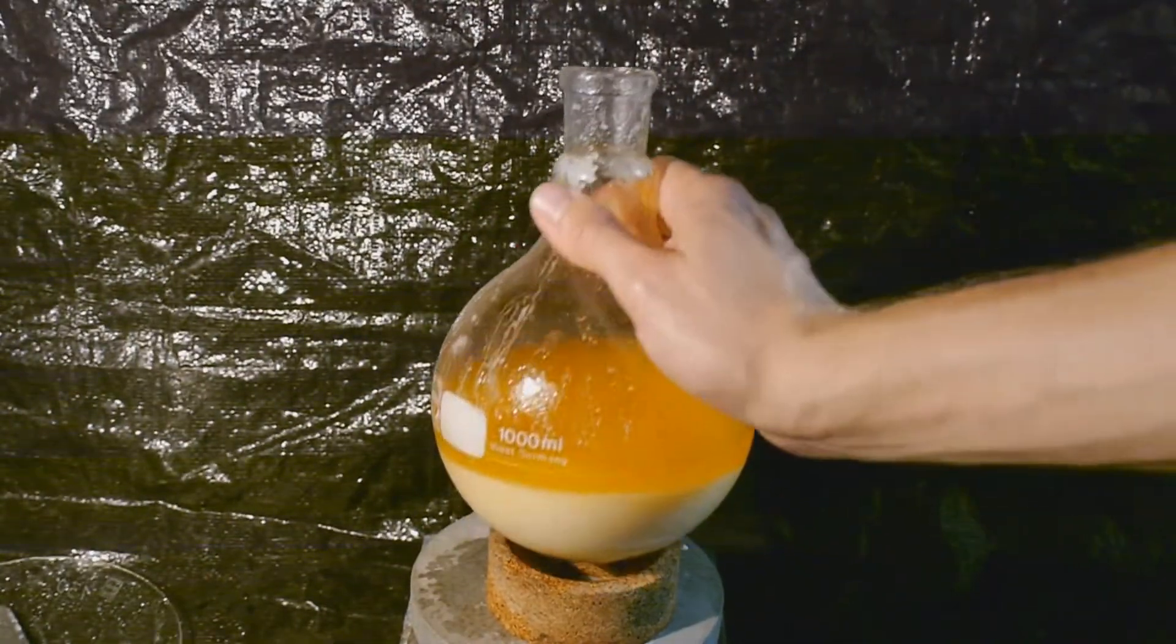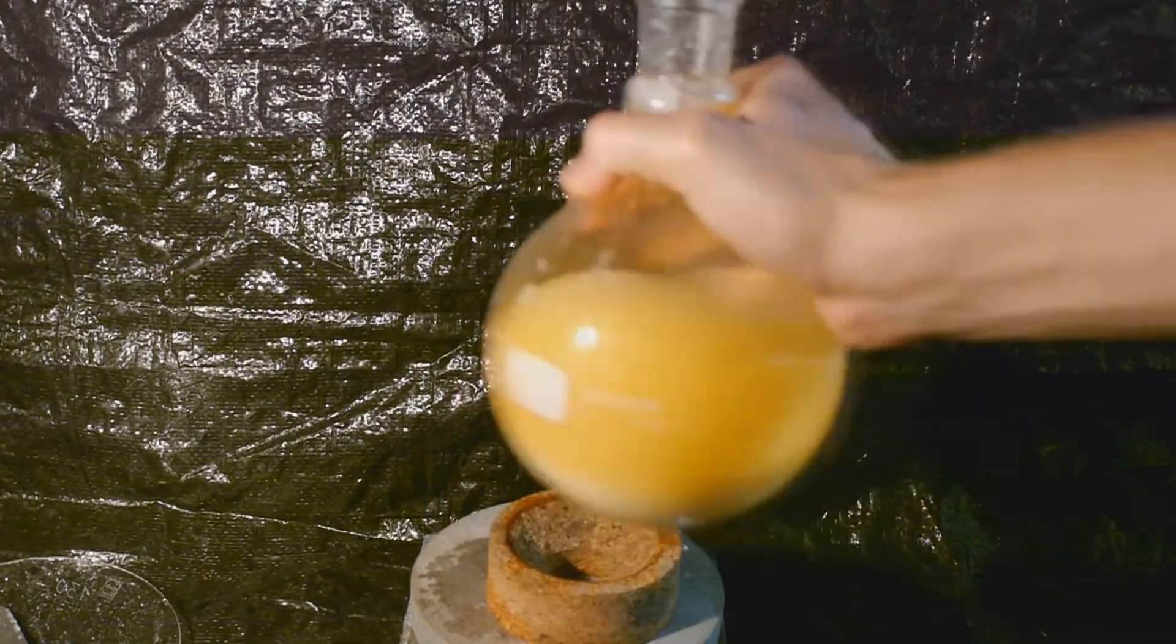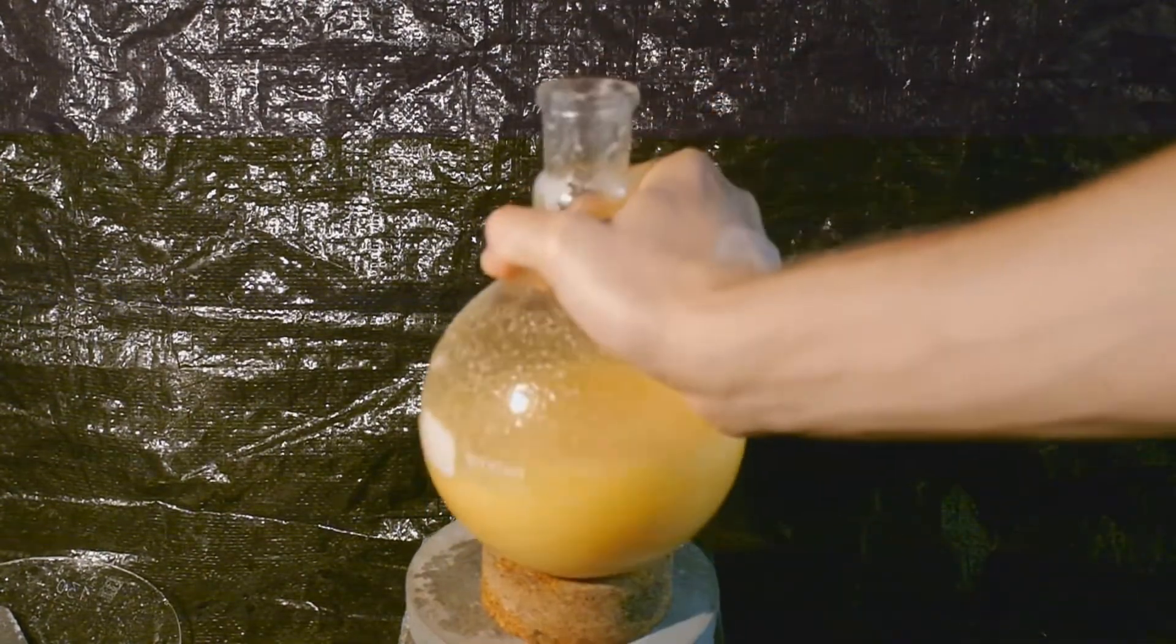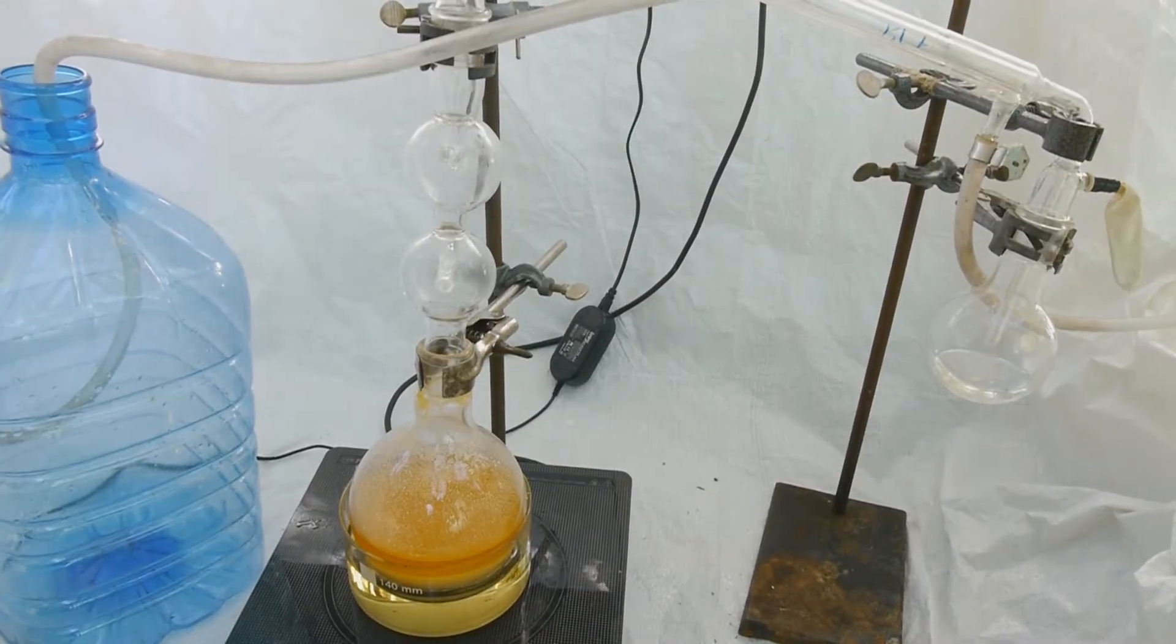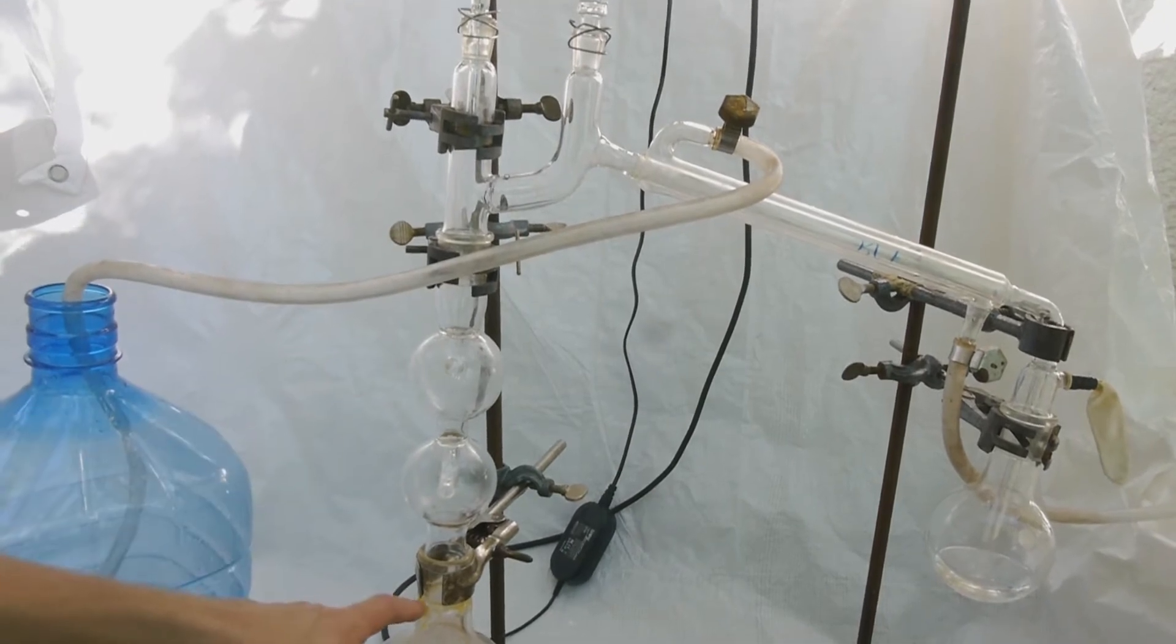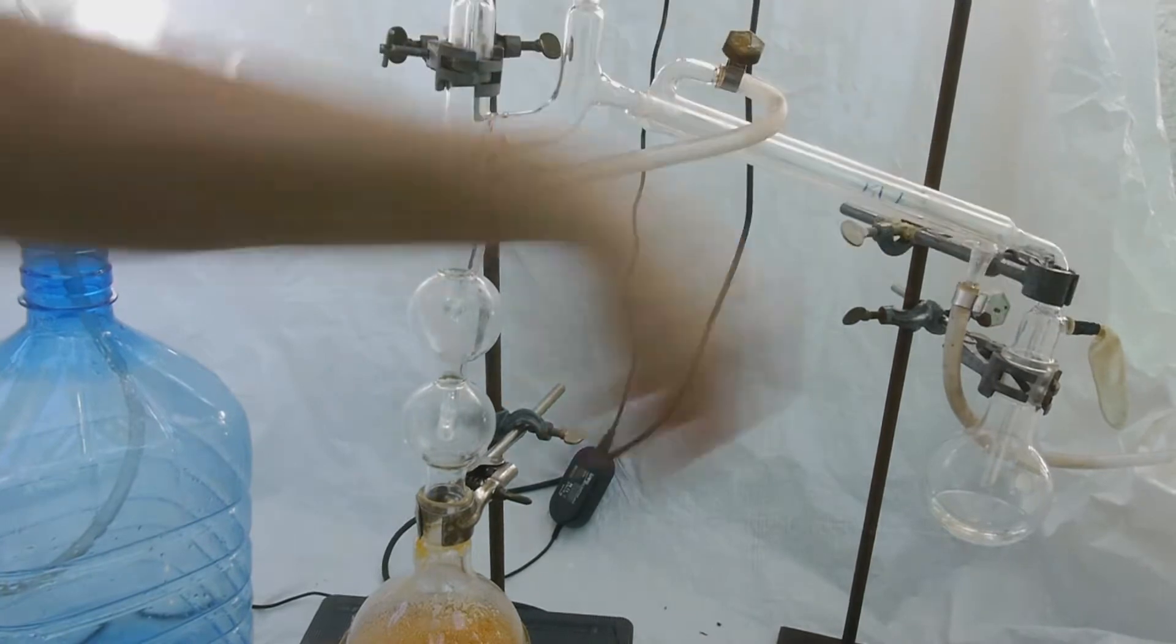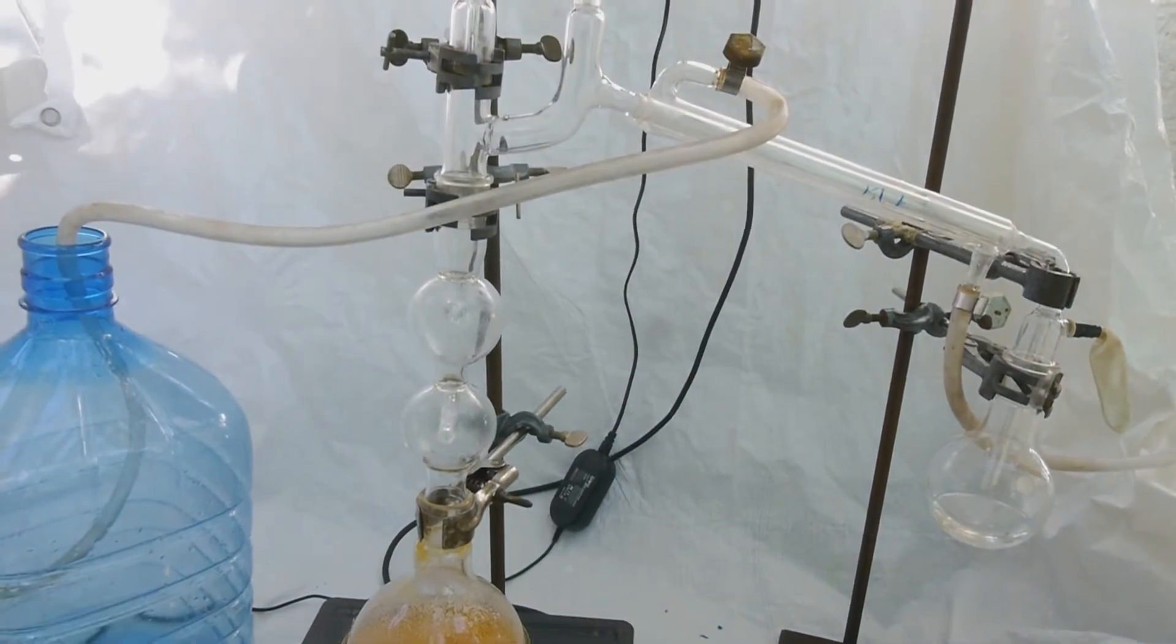Okay, and now this is going to stand overnight so it can hopefully slowly react and form ethyl bromide. I've set up the whole thing for simple distillation now, and because this is so volatile, I've made sure that all the joints are tightly greased and I've put a balloon at the end here and wrapped it around very tightly.